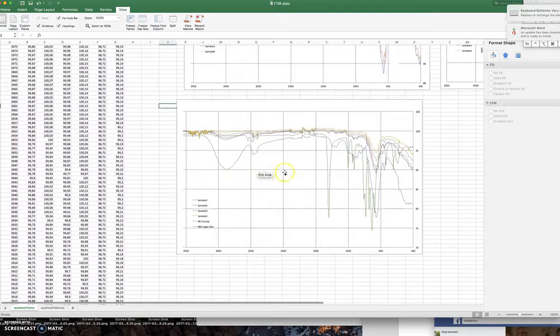Then in this other sheet down here, I have found 2 other spectra I had from last time we had the demo, where I have one of viscose and one of PLA. And the blue one here is viscose and the green one is PLA. So there is this very clear peak around 1750. That is from the PLA, that is a contribution from PLA.